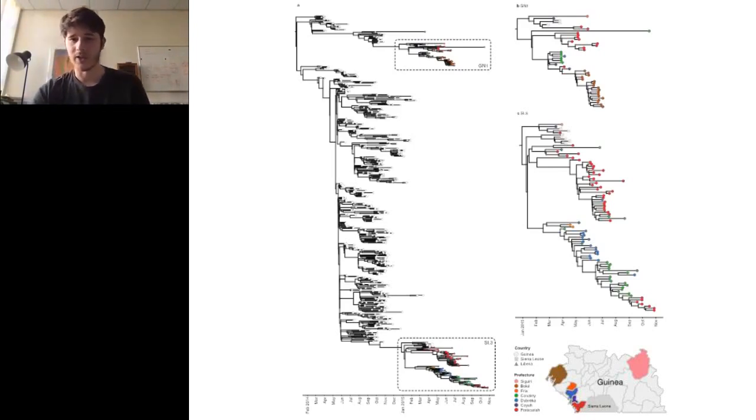And that can be very useful information if you're tackling an outbreak, because you're able to see across big geographic regions or even countries which isolates are related to which isolates, and that might not be so obvious if you're dealing with this on the ground with a very narrow focus. The people are quite mobile, and they're able to move the virus across large distances, especially if they're using air travel. So this kind of analysis is very important for being able to see how cases relate to each other, and that was very useful information for the people on the ground.